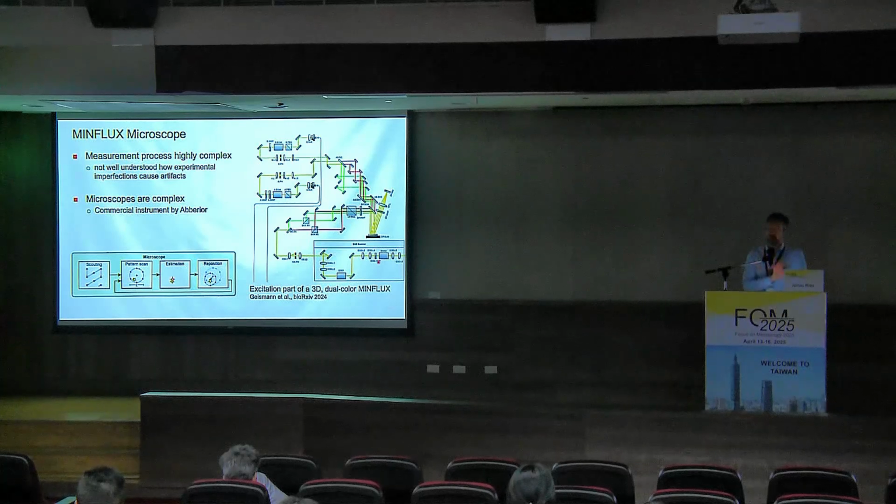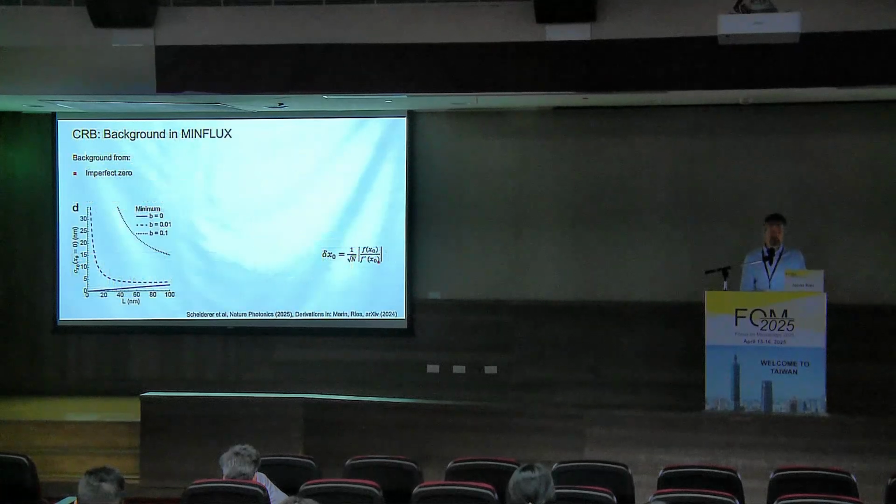So let's look at how some of these artifacts are generated in MINFLUX. First, let's look at the background. To do this, we can use the standard formalism, Fisher information theory, and calculate the Cramér-Rao bound, taking into account background. And this is what we did here.